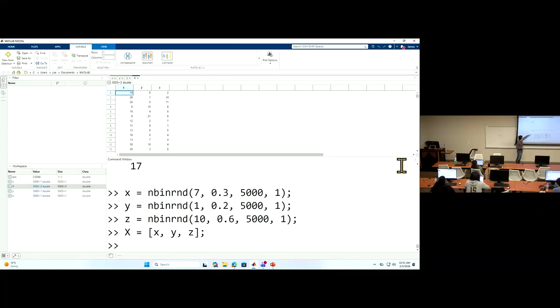So you may want to create more. If you want to create 2,000 genes' expression, you may have X1, X2, X3, X4, so you can do a loop. Right? You know how to do the loop to concatenate them together to make a big one. It just repeats itself. Well, when you repeat itself, you want to have a way to do these combinations of these 2 parameters. That's another question. So how can you change this every time you add 1 gene?